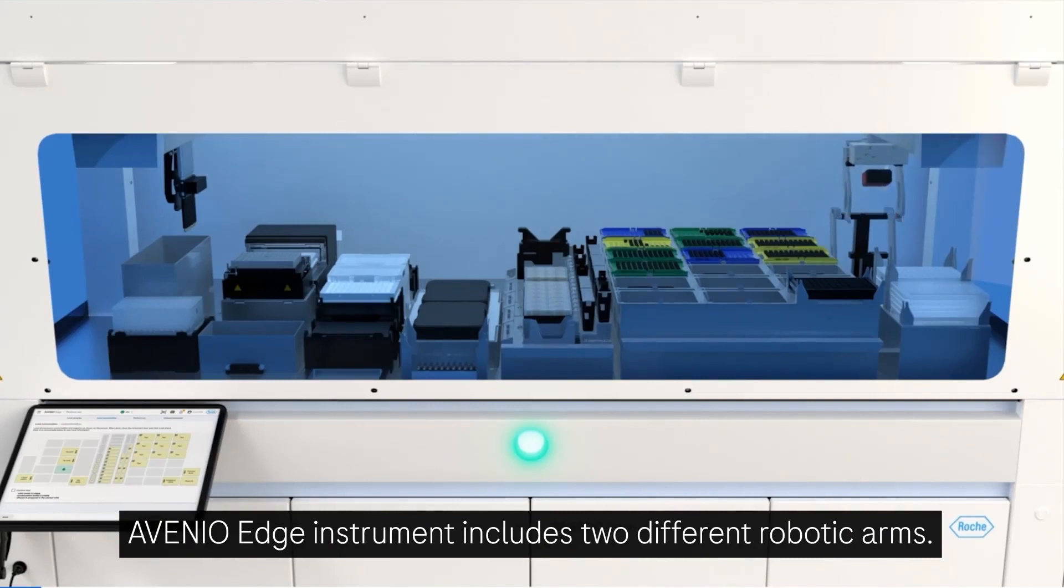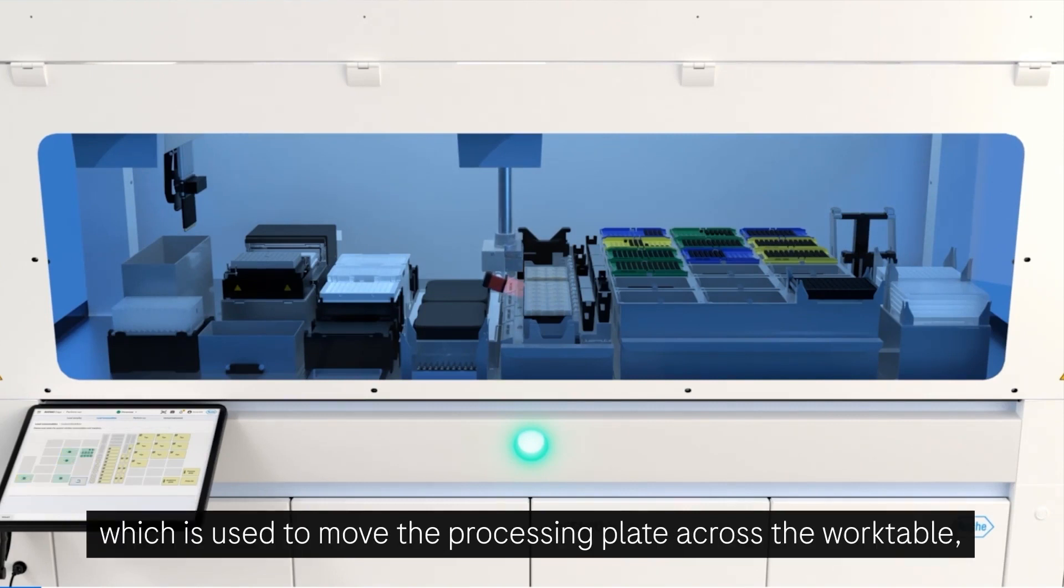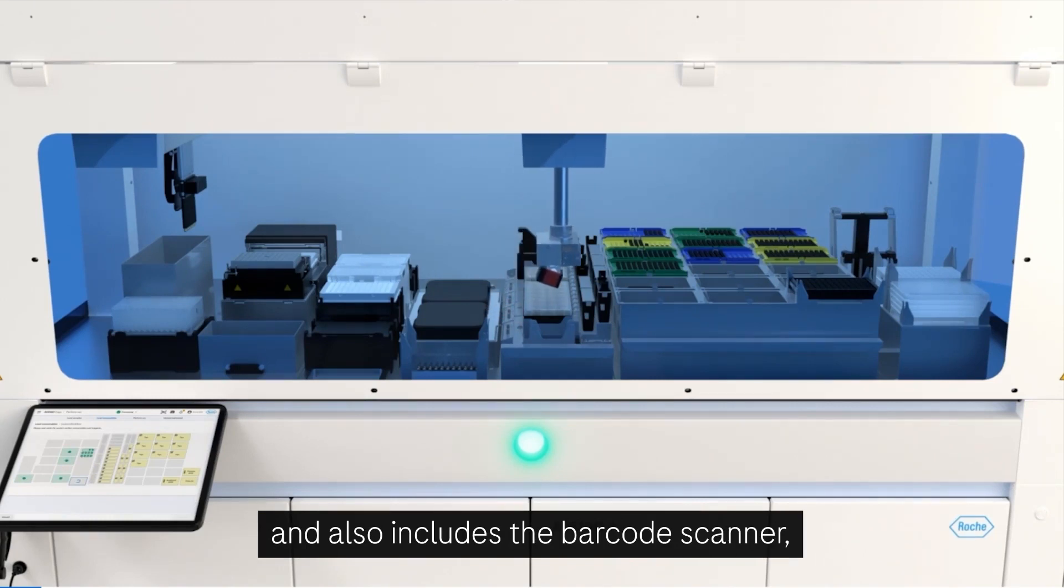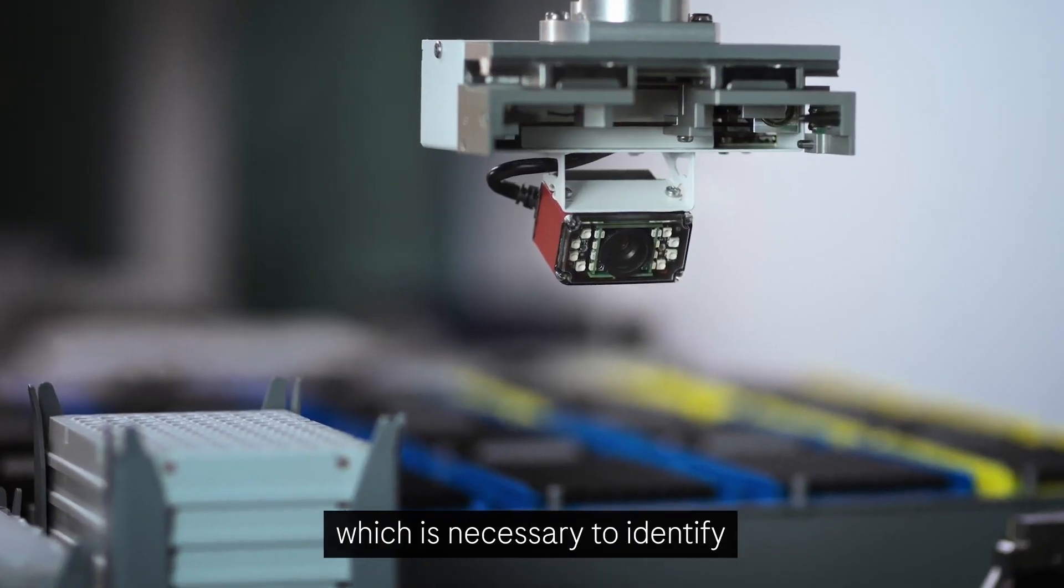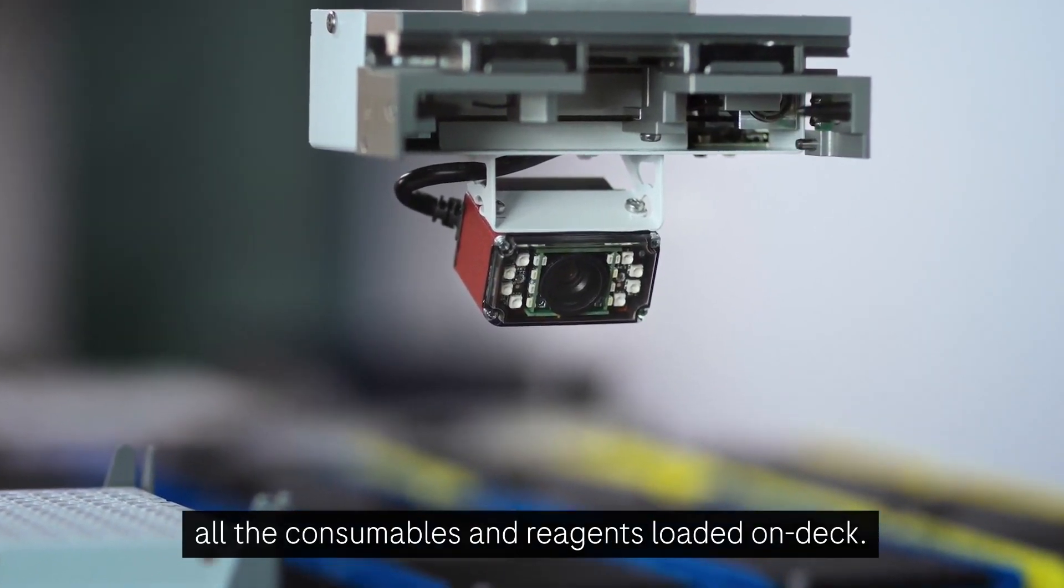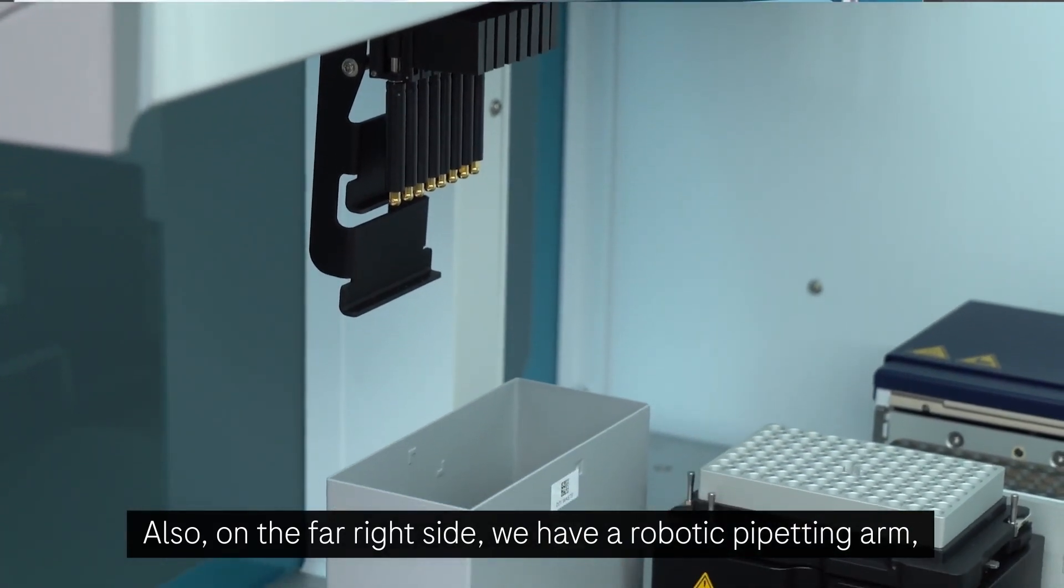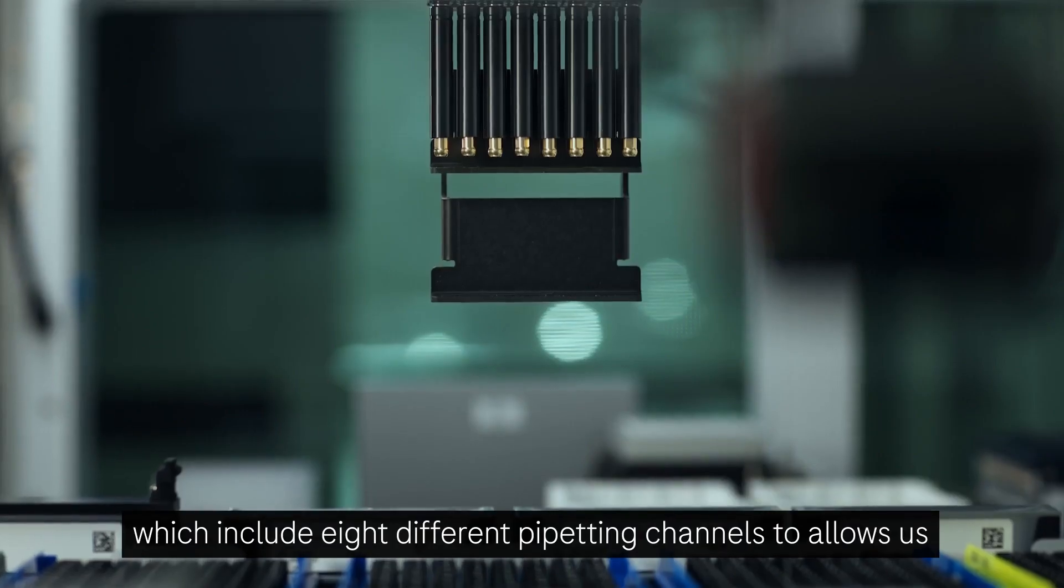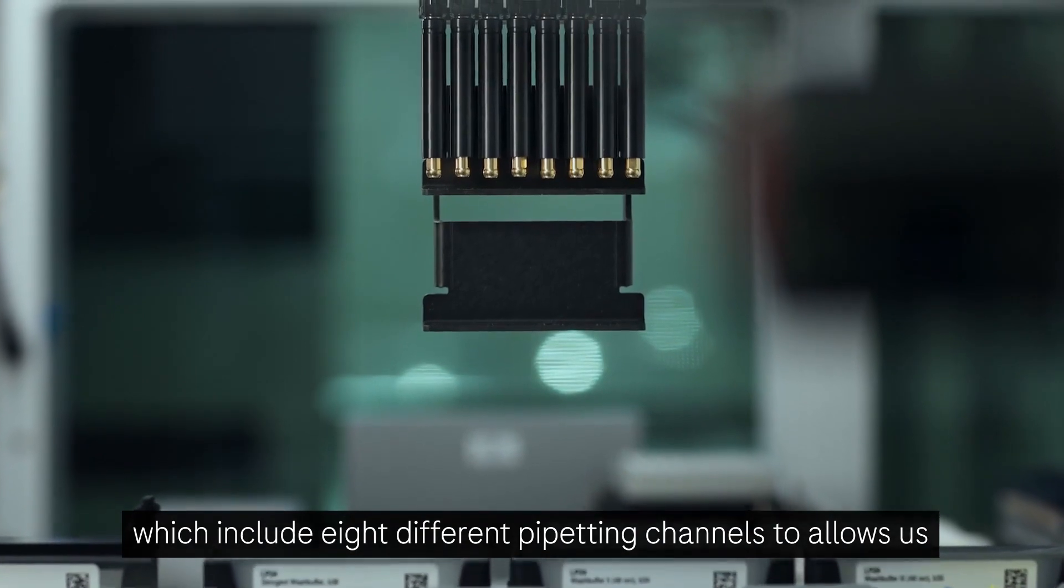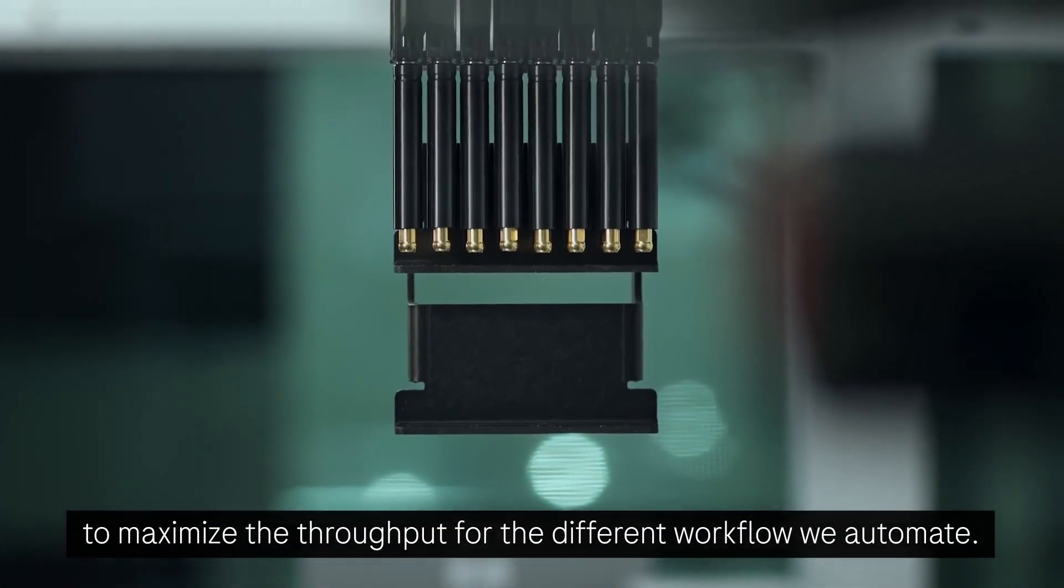The Avino Edge instrument includes two different robotic arms. We have the robotic gripper arm, which is used to move the processing plate across the work table and also includes the barcode scanner, which is necessary to identify all the consumables and reagents loaded on deck. Also on the far right side, we have a robotic pipetting arm, which includes eight different pipetting channels to allow us to maximize the throughput for the different workflows we automate.